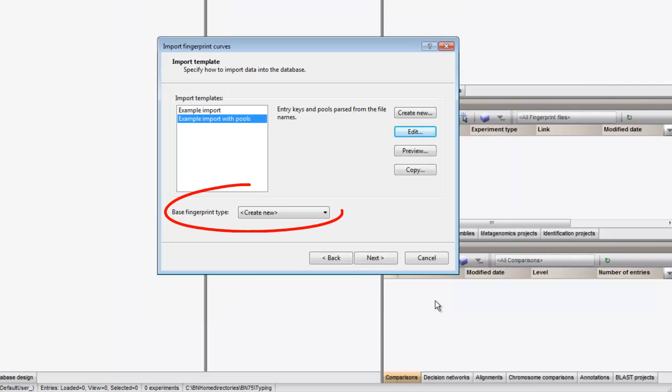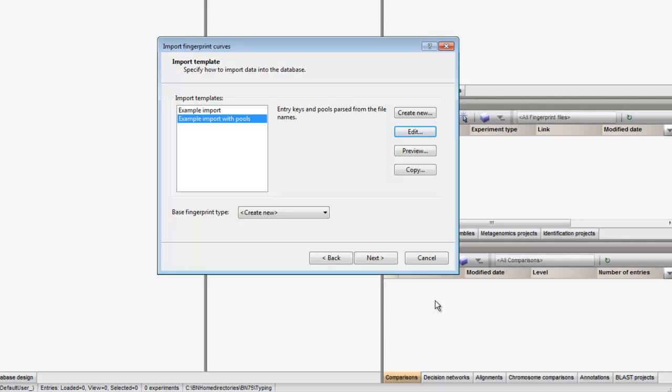I have no fingerprint types present yet in this database, so the import wizard will create a new one, and I enter a name for it.